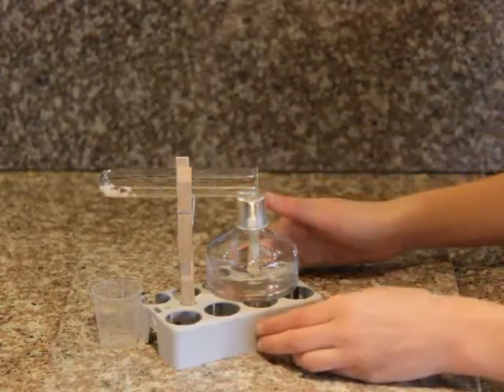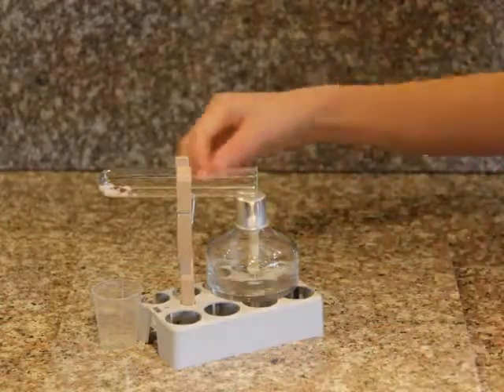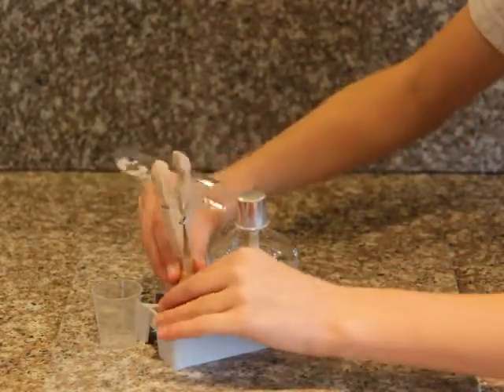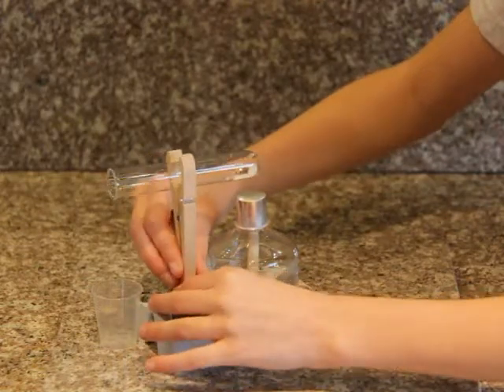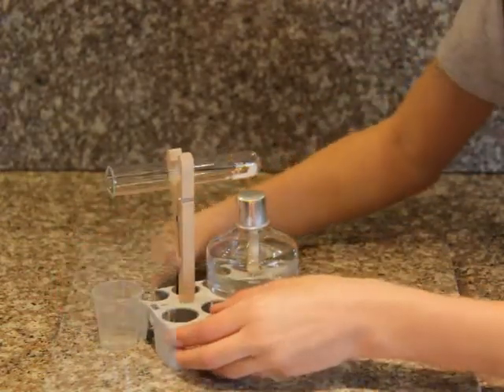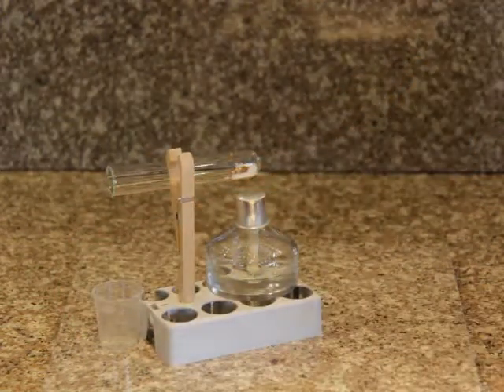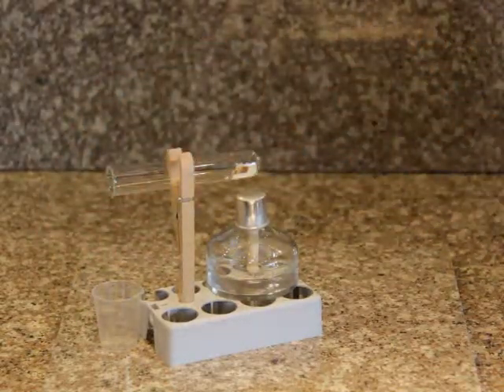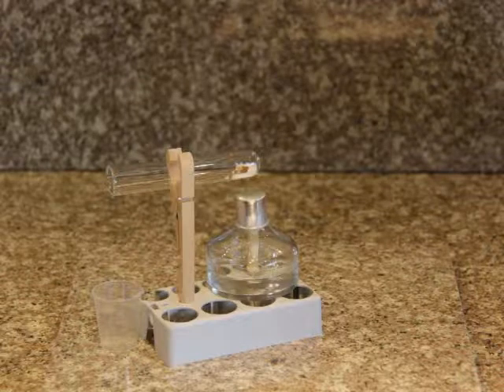Then, rotate your test tube, and place the small graduated beaker directly underneath the edge so any drips of liquid will go into it.